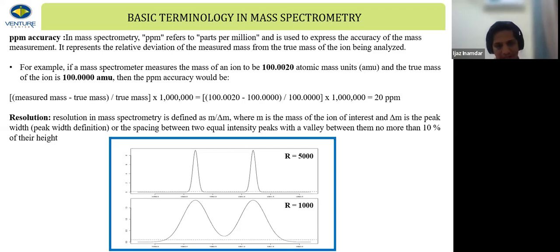If you're talking about HPLC, she might say don't stop until you reach a resolution of 2. Don't stop until you reach a resolution of 5. So this is the end point. You should develop your method until you reach that resolution. And ICH, FDA, or USP, they also have a method development criteria.